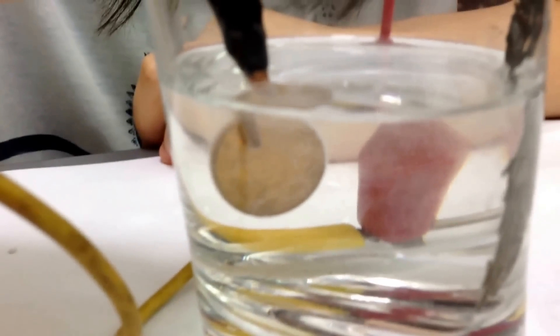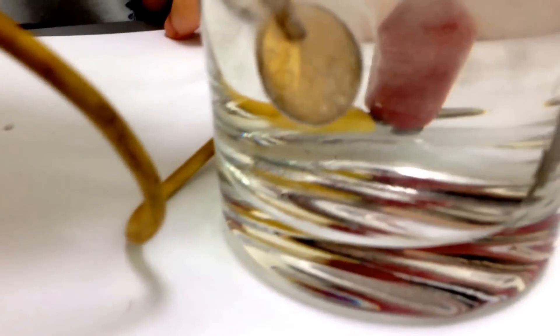Turn, turn — flip, flip — to face the anode.